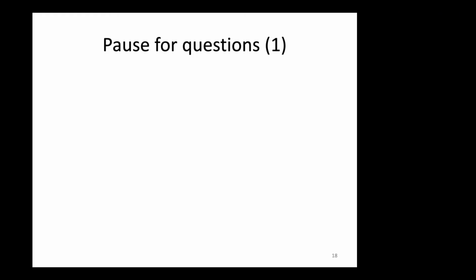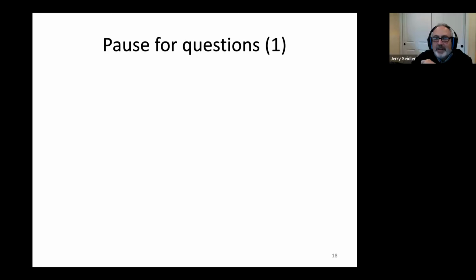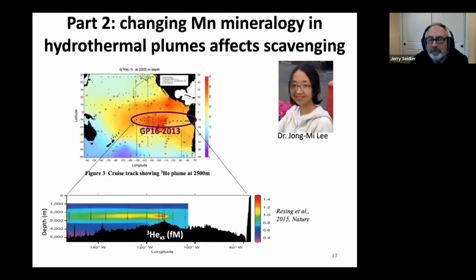All right, and a last question from me. You have this tens to hundreds of nanograms per square centimeter of sample. I was trying to convert that into monolayers, and I didn't quite get there. Should I be thinking a sub-monolayer, 10 monolayers? Oh, probably more than a monolayer. I haven't done that calculation. Okay, but it's also not pure iron or pure manganese. There's a question of what fraction of the minerals captured are actually iron bearing or manganese bearing. That's right. And in fact, most of it is not. Most of our particle mass is not iron or manganese. Hence the need for microfocus. That's right. Okay, thank you. You should continue. It's a great start.